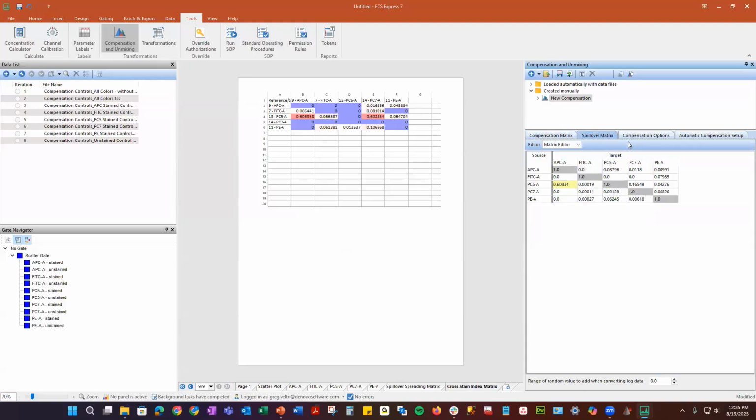So all of this information is actually a file that we can save. And the way that you save that is just going to here, the save button, and then you can save it there. Now, this is a little bit different than FlowJo in that we're doing it outside of another layout, but the software is open, so I can then save this as just my compensation information. The reason being is if I wanted to have multiple compensations, I can. So let's say this was a compensation on cells only, compensation on beads. I'm trying different types of clones to see how things are going.